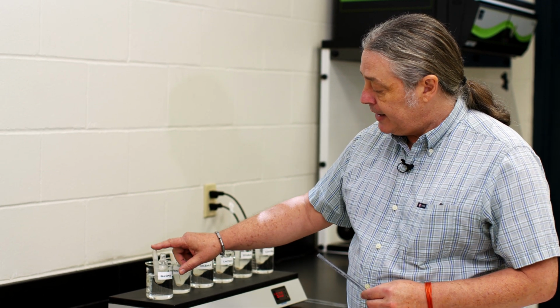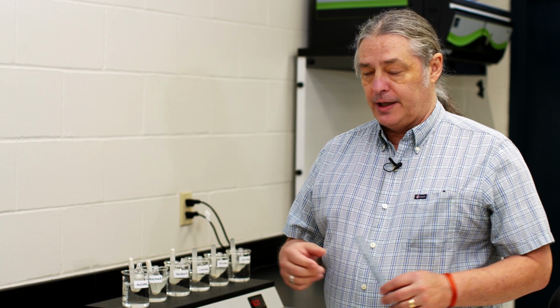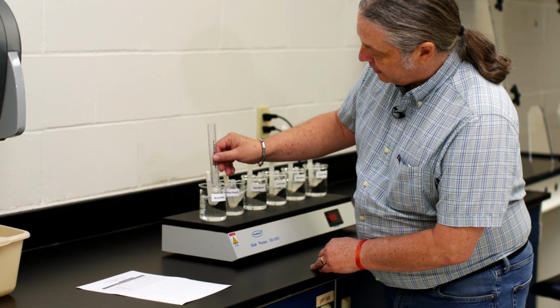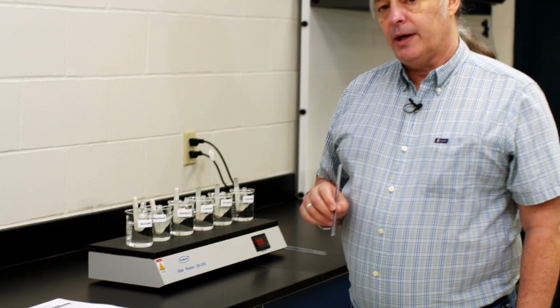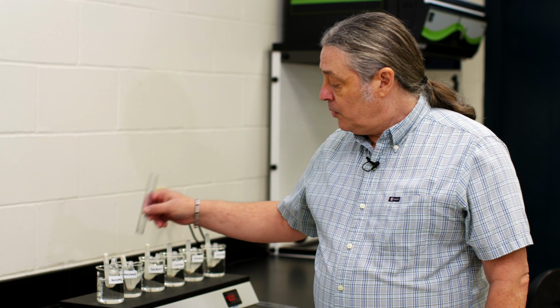With that blind end of the fermentation tube, the CO2 bubbles that do get produced, if they get produced, will collect at that end, and we can do a quick measure of how much collects during the time period that we're working with at every increment indicated in the lab manual directions, and see which produces the most gas bubbles, which we would assume is giving us an indication of the most fermentation being done.